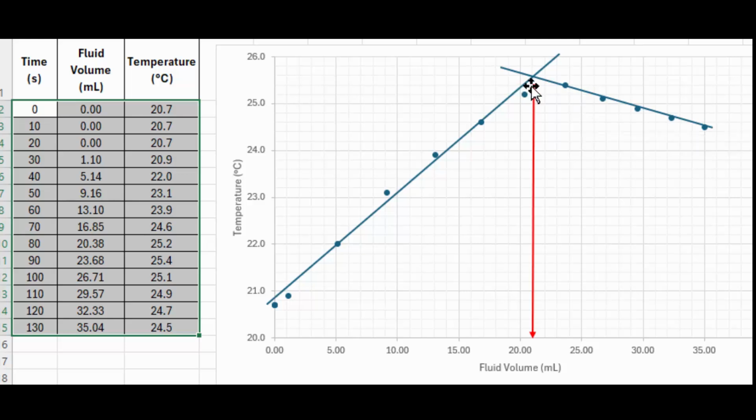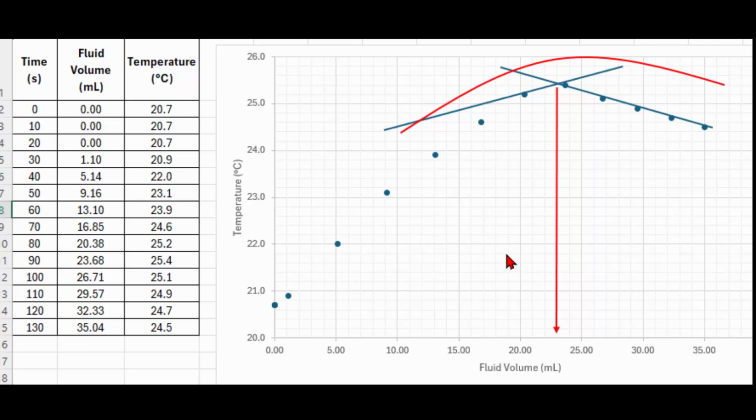And so it's kind of way off, and that's why I never really liked it, because you never know how high it's going. So just to put this line in here, you never really let it reach its highest temperature, and it's constantly cooling, and you can see it cooling on this angle here. And so even if I just take the most extreme here, I still don't get anywhere near 25.